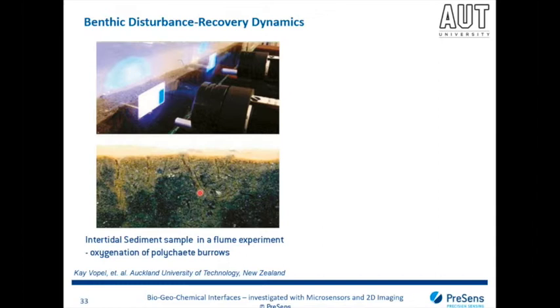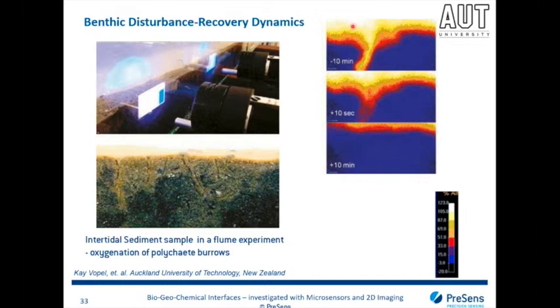If you now apply oxygen imaging to that scene, you can see, for example, these burrows where the highly oxygenated water from the seawater phase is pumped into deeper parts of the sediment. What you can also see is the original, pretty steep concentration gradient from seawater towards the anoxic sediment parts. You can also see that the profiles depend on where you take your measurement, because they can be highly variable depending on whether you have just a plain sediment water interface line, or disturbances, such as those caused by polychaete burrows.